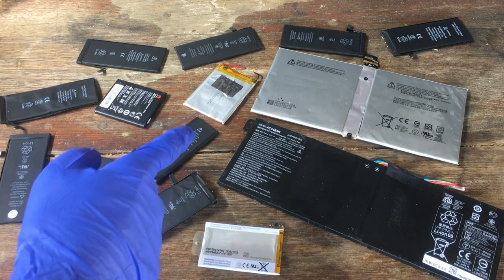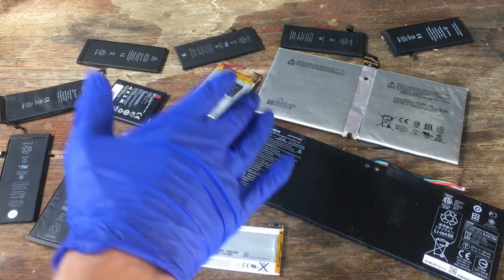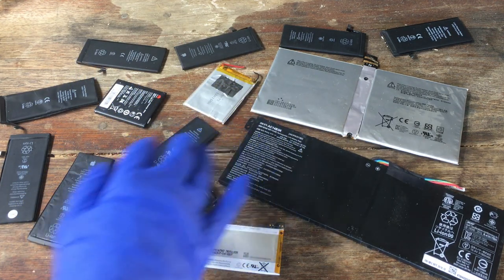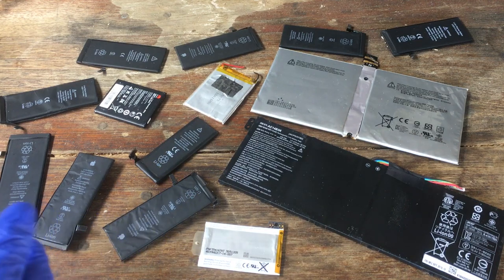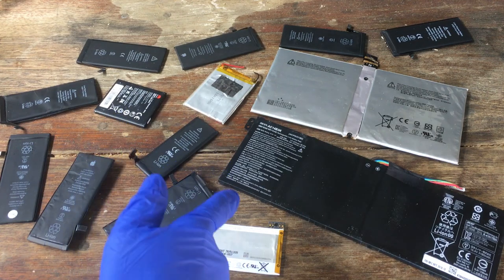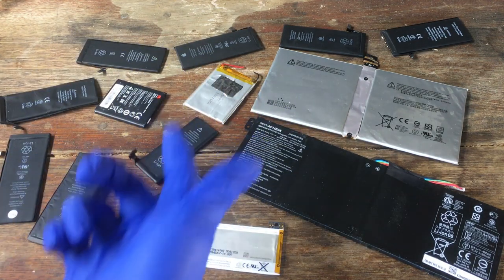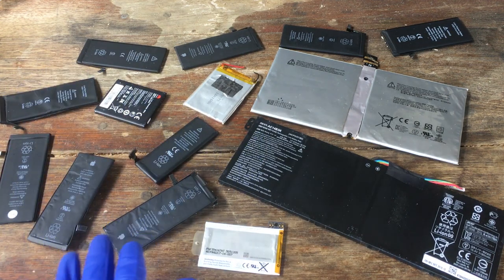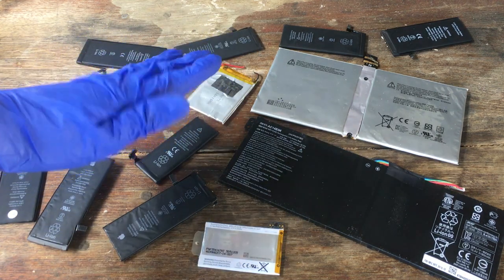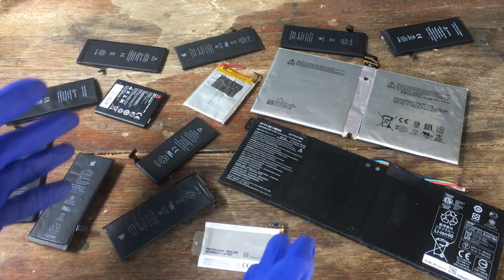The second method that people were a fan of starts out pretty similarly to the first. It involves extracting the electrode materials and dissolving everything up in acid — not specifically nitric acid, but it could be. Then it involves selectively precipitating out our aluminium, our manganese, and then our cobalt and nickel, eventually leaving us with lithium in solution, which we can precipitate out as a carbonate. That's a very simplified overview of the processes, because I don't want to ramble on too long, and we can explain as we go.